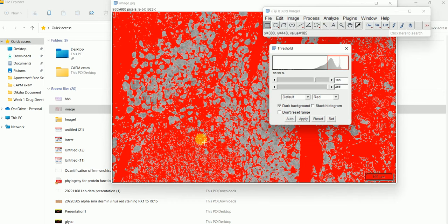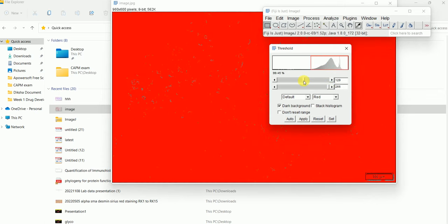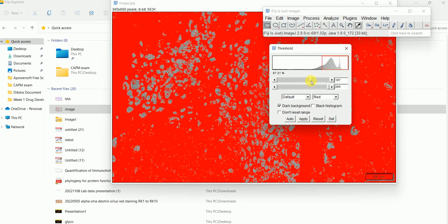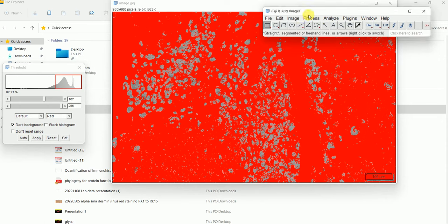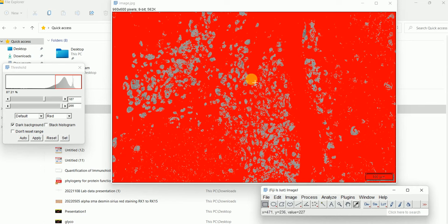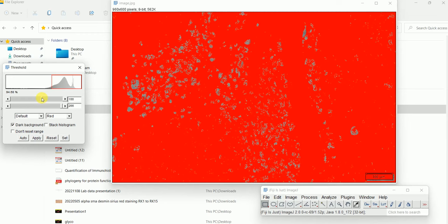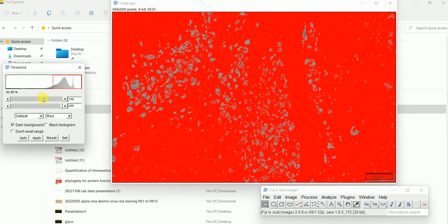Now you will adjust the threshold in a way that you will only see the positively stained area. You have to play around a little bit. When you adjust the threshold, you have to make sure you don't do too much or too little — it has to be more or less similar to what you have in your original image. This black area is corresponding to the red area.